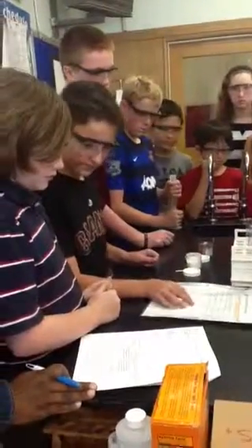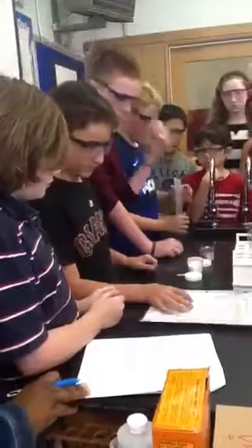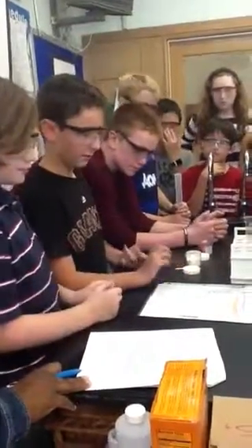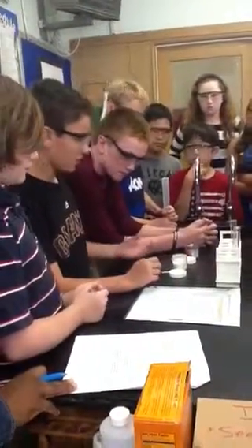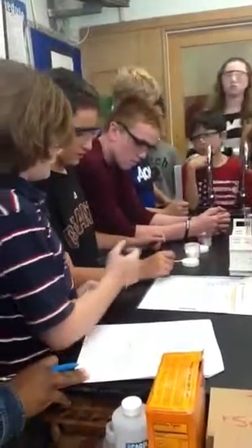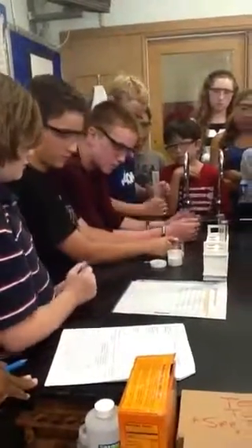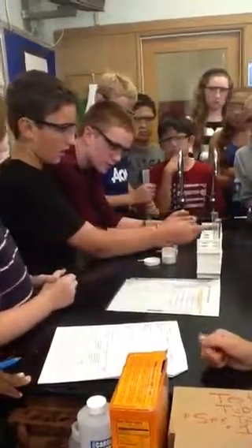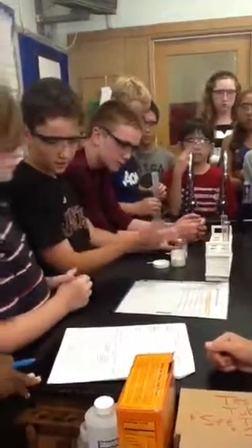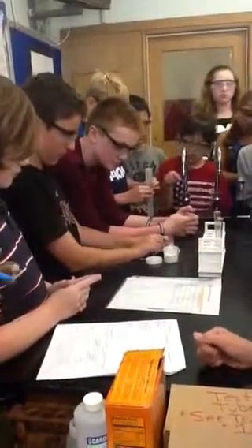What do you think it's generally about? Do your pre-observations, okay? So the title is comparing the two mixtures. You have to add everything and compare them to see the differences of the two mixtures, substance E and substance F. And what are you putting the substances in? Test tubes, and then you put water in. Okay, so it's how they're reacting in water.